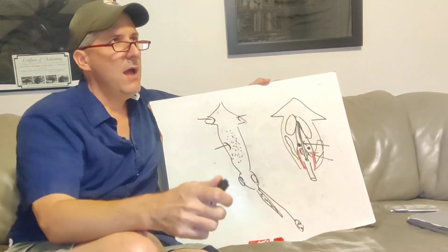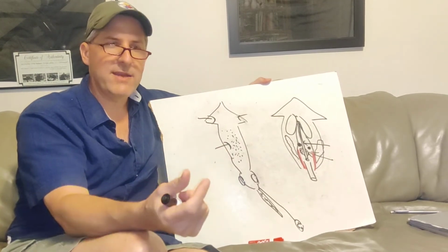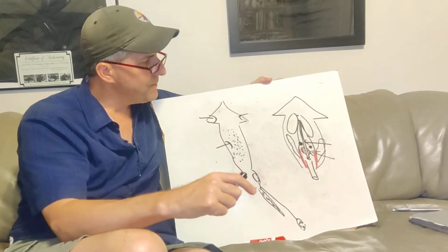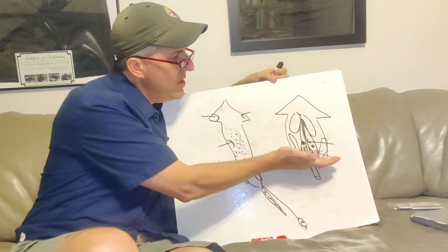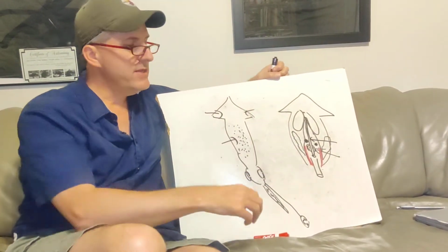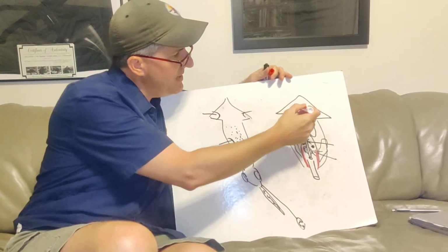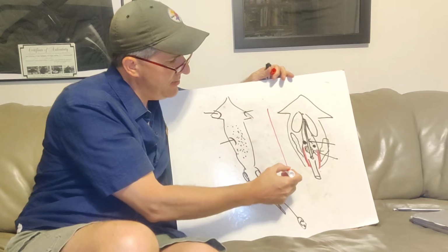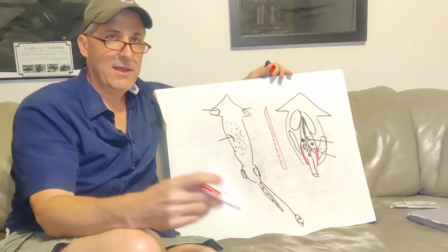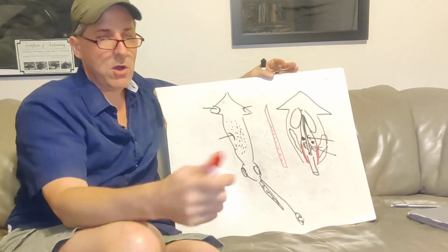The male, the testes are smaller. They're kind of a creamy white color, and they tend to be gushy, almost like a spongy texture. Now, once you ripped out all the contents as I showed there, underneath you would see what looks like an amber colored plastic. It would go from here all the way down to the base. So it looks like a pen, like a quill, like you would take out and write with. That is the internal shell of the squid called the pen.